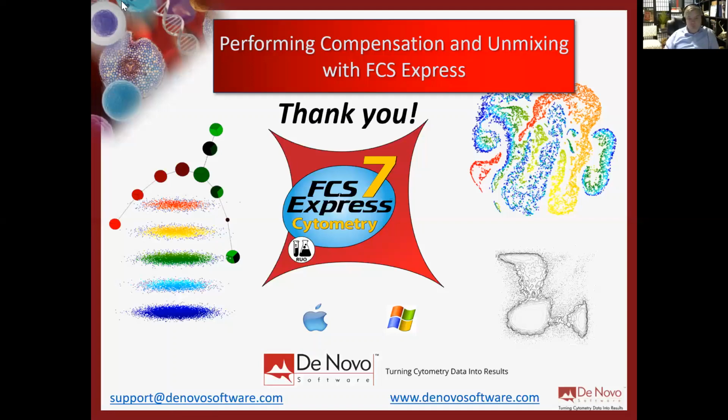There are some statistical ways that you can check it by taking a look at the secondary stain index to see if your comp or unmixing values are correct. But what we highly, highly discourage is anyone manually tweaking any compensation or unmixing, because when you're trying to do that, you're essentially in a way manipulating data, and you can not understand the impact it has on other parameters. So no one did ask that question, but I just wanted to use the opportunity to discuss that.